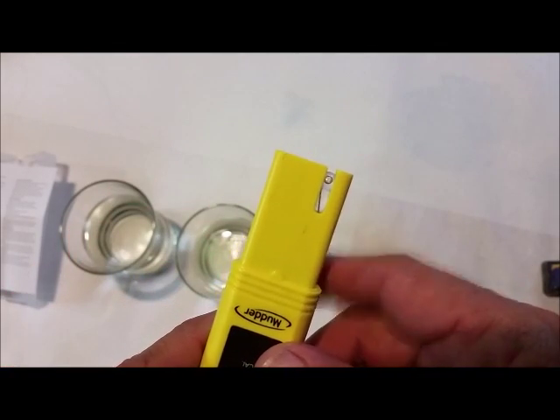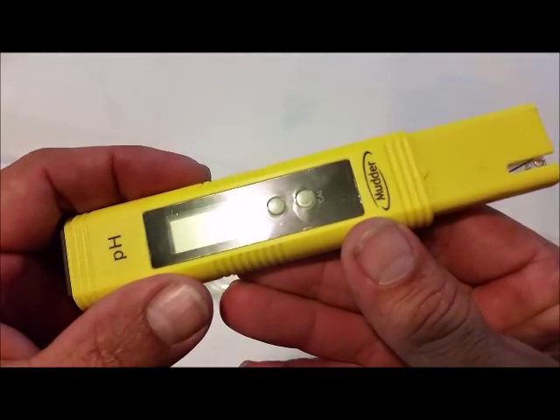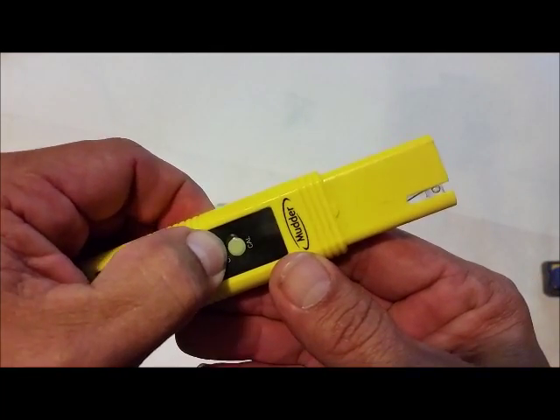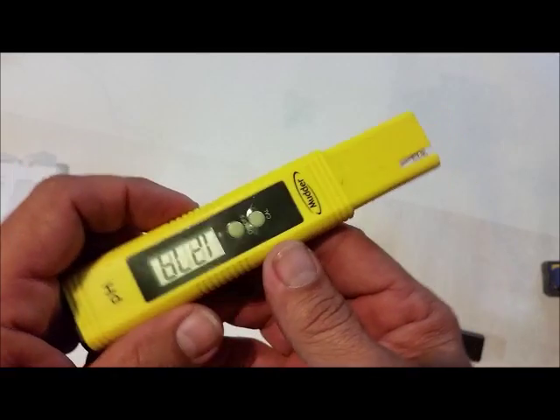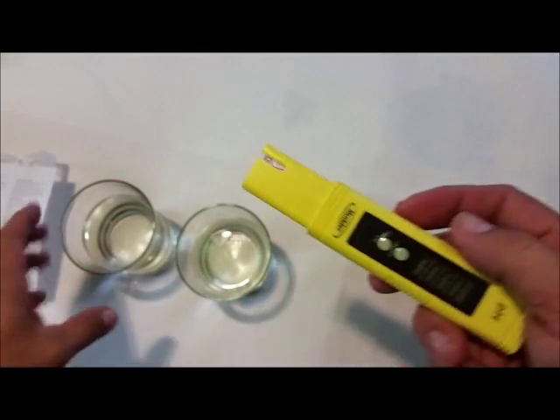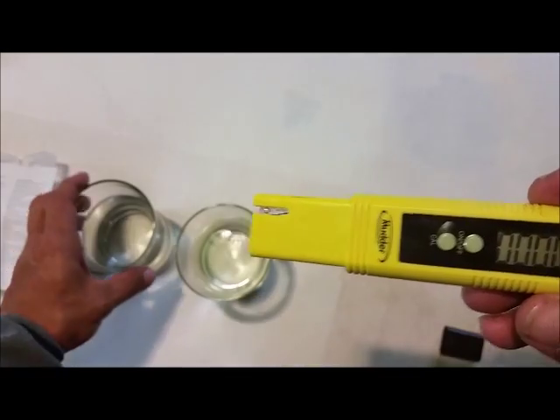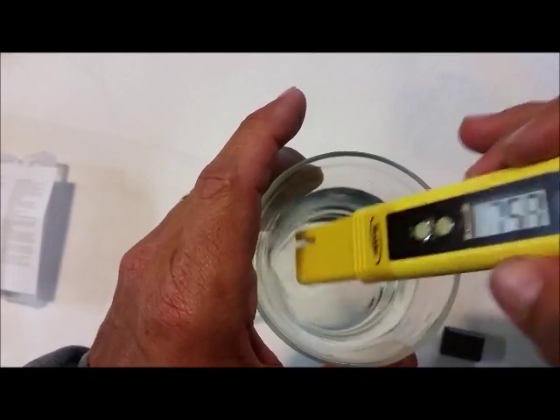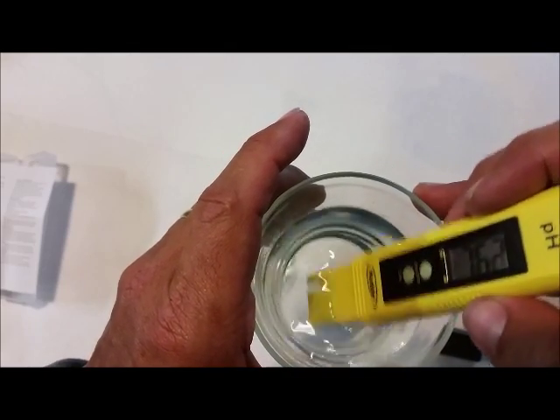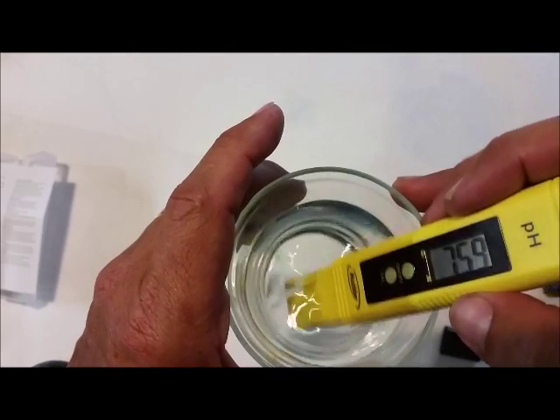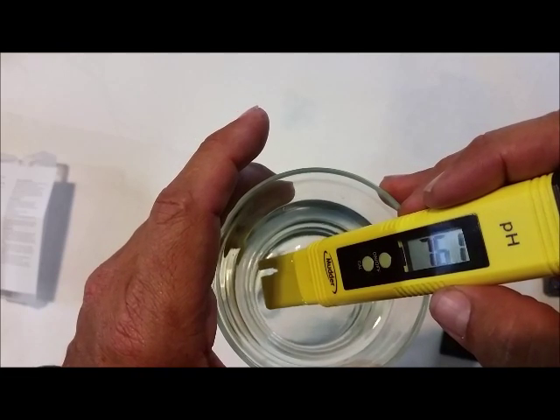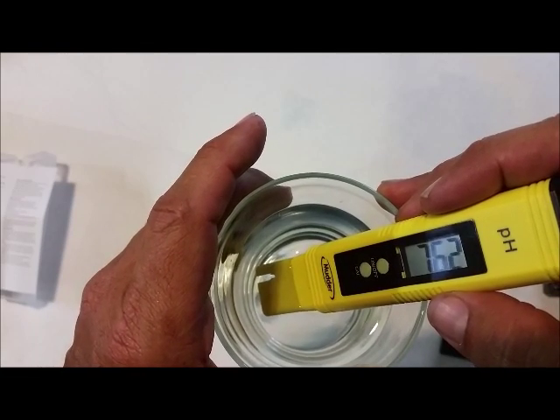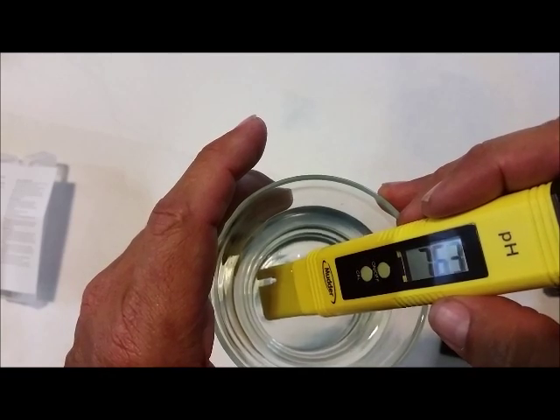That is what's going to do the testing in there. See that bubble? pH meter. Turn it on and it says seven is normal pH levels for like tap water. So we'll get it in here, swish it around a little bit until it levels out. You can see we're about 7.62, 7.63.